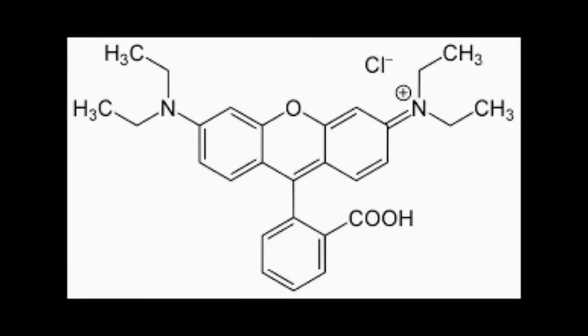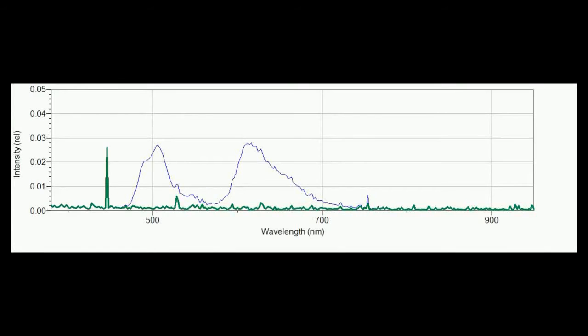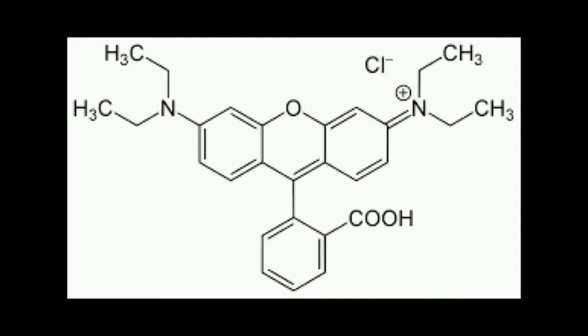Because each molecule will have intrinsic differences in its composition and structure from any other molecule, the lambda max during emission spectroscopy can be used to identify what the substance is that is emitting that photon. This means the statement that lambda max is determined by observed color is incorrect, which is backed up by in-lab evidence in which the 1-to-1 mix actually showed 2 peaks, indicating that these 2 peaks actually correlate to the lambda maxes of the 2 dyes.